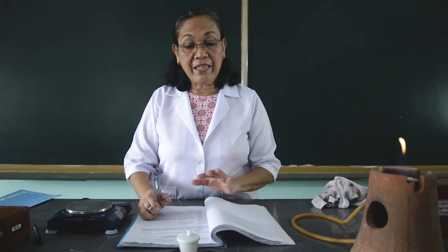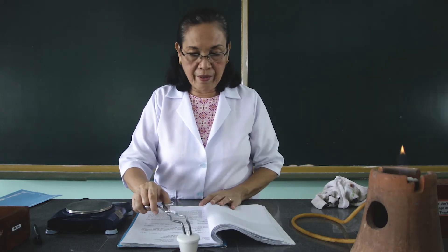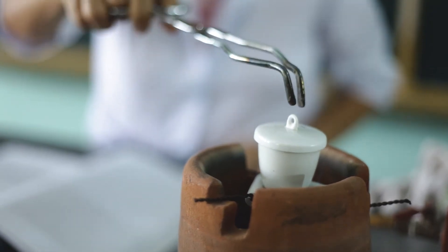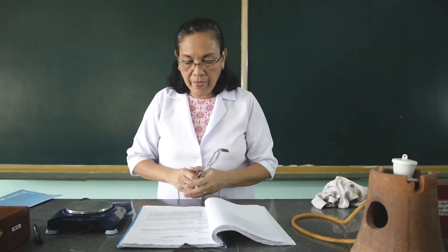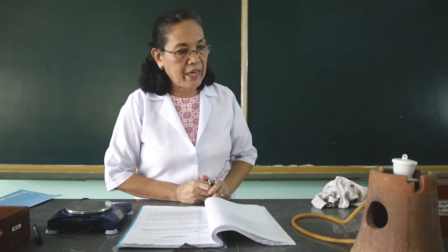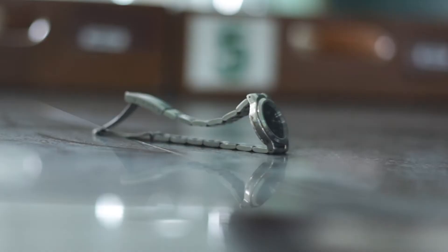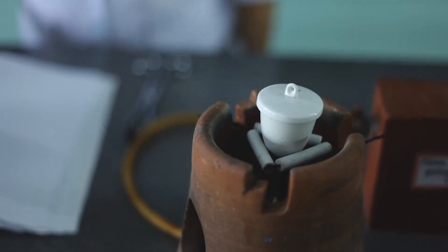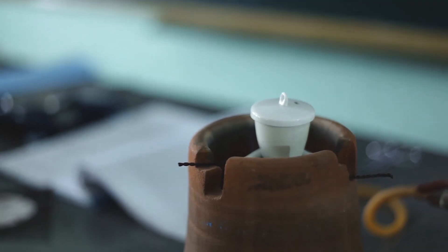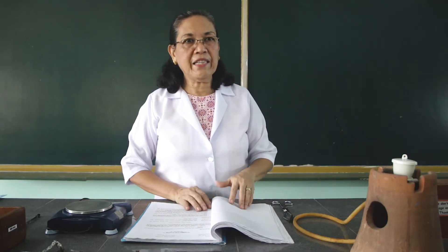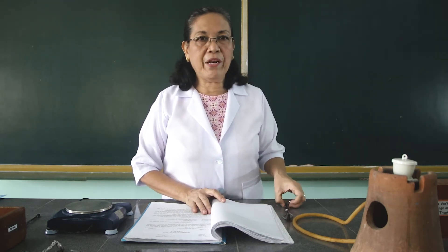After cleaning it, we are going to heat this over the flame, together with the cover. We are going to heat that for five minutes.